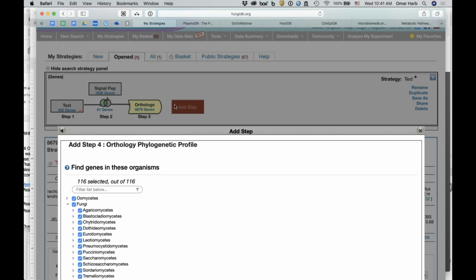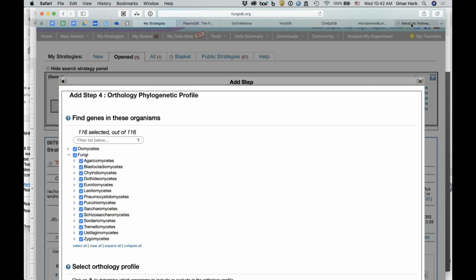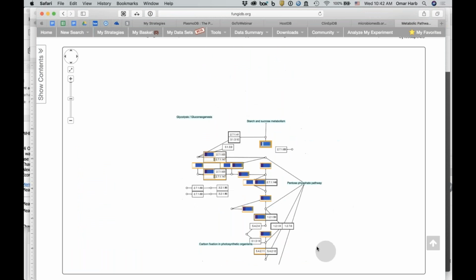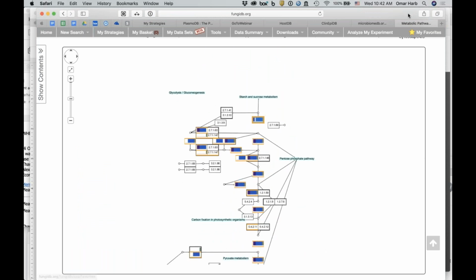And now it'll ask how many of these, it'll return any of those genes that do not have orthologs in mammals. And so we'll let this run in the background here. I'll quickly look at this table here. Let's see if anything else we want to show here. I don't think so. I think this is good.